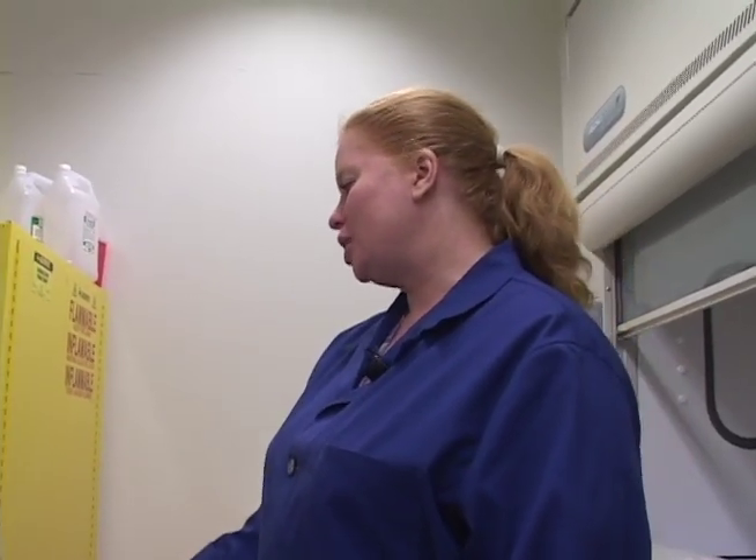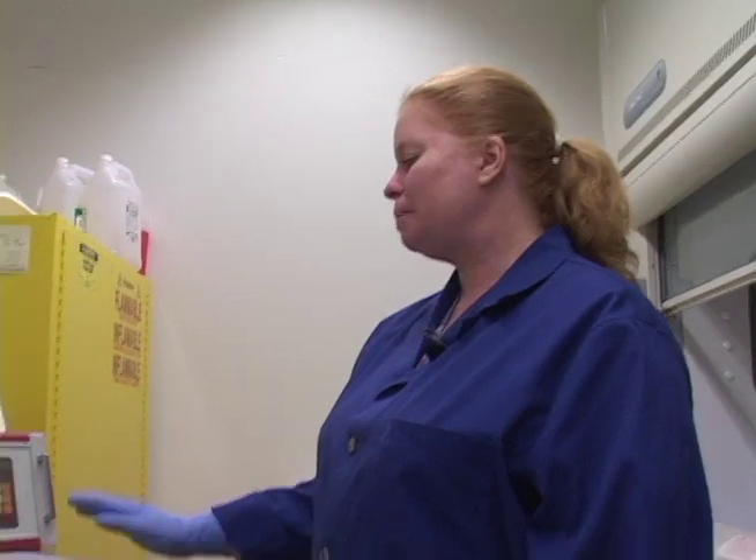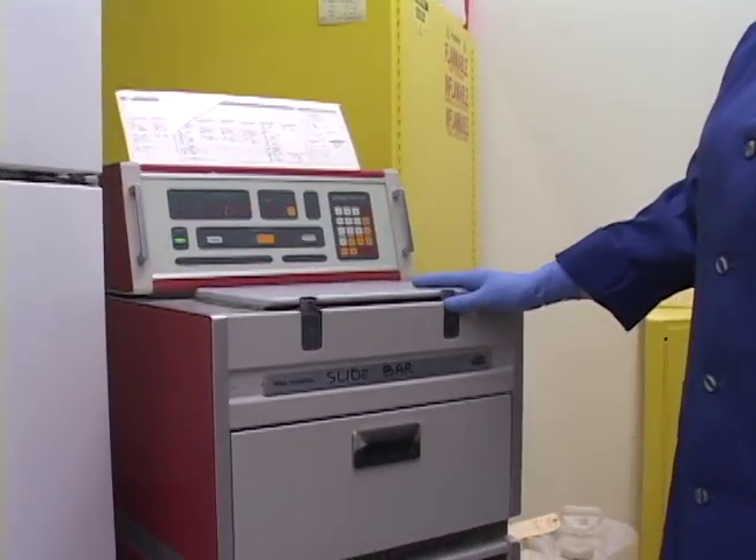We're going to do a full processor change. This is a Tissue Tech VIP 2000, model number 4618.